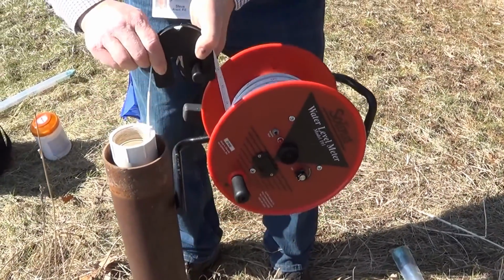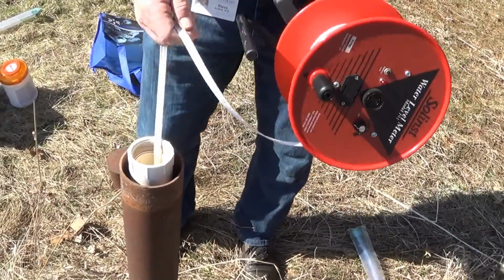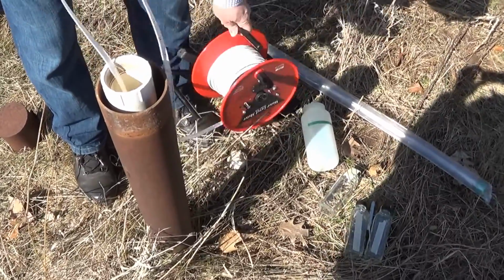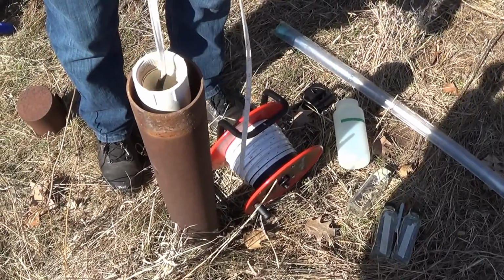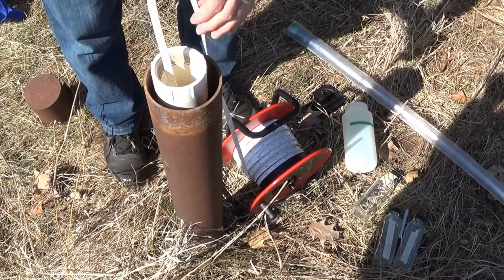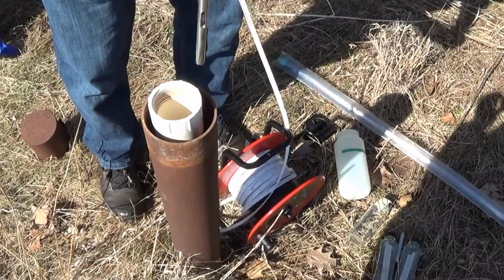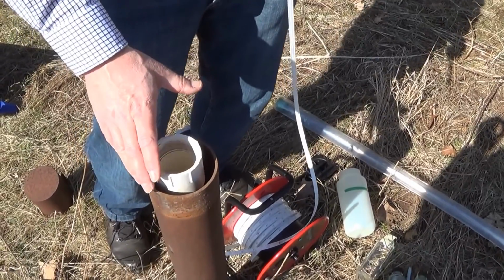We'll pull this back out, and in our case I'm just going to lower this right down using just the tape itself. Okay, so you can set this and we'll lower the tape down. Okay, we do know it's a 42-foot deep well, and as I lower this, it should give us a little bell. Oh, I should mention first. I'm sorry. We don't know necessarily what is in this well.